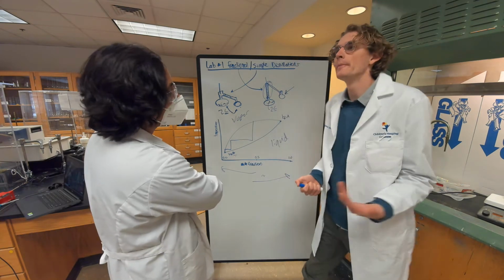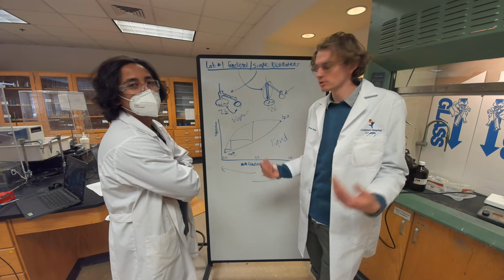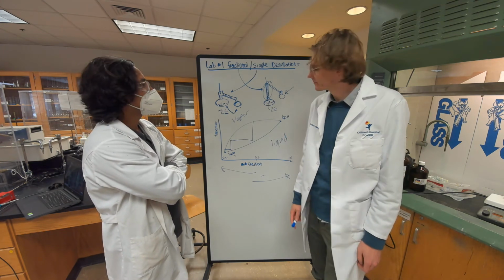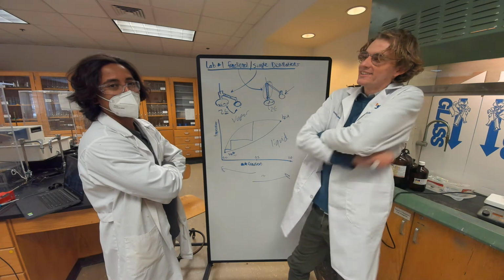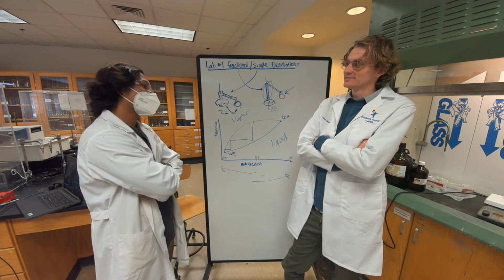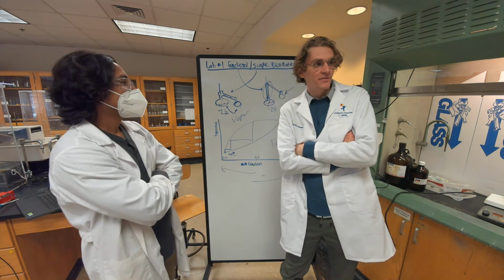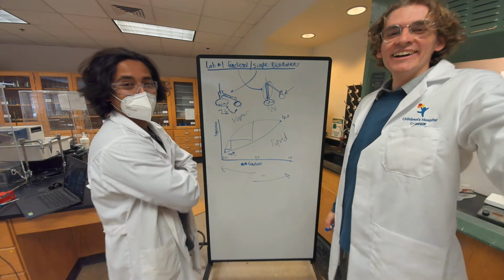For the first couple of weeks, OChem 2 lab is a little weird because you start out just learning a whole bunch of techniques. It's technique based. We're going to teach you how to do the distillation and run instruments, and then probably toward the end of the quarter, we will teach you how to synthesize certain chemicals and then figure out the chemical characterization using all the instruments we have, like NMR, IR, and hopefully GC. Our gas chromatograph is currently out of air, but it will be fine. We'll make it work. We're chilling.